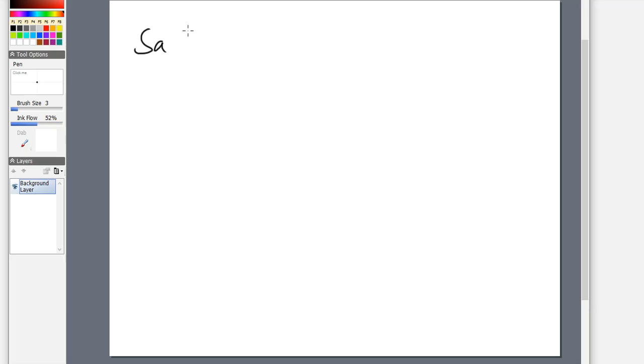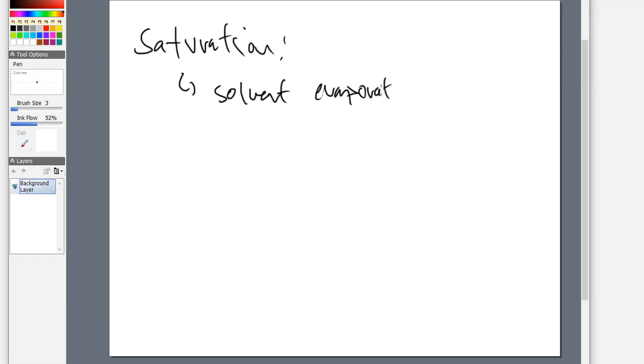So there's a couple of terms here that we want to talk about, and the first one is going to be called saturation. So if I'm using some plates and I'm in TLC theory and I've got samples that will go onto the plates and these things are going to separate, well, there's a whole kind of thing that I've got to do in the beginning before I go through the chromatography aspect of what we're getting ready to do. So saturation is one step in this process. Saturation is basically this concept that the solvent components are evaporating. So this is an idea that gas phase is actually getting generated through this step.